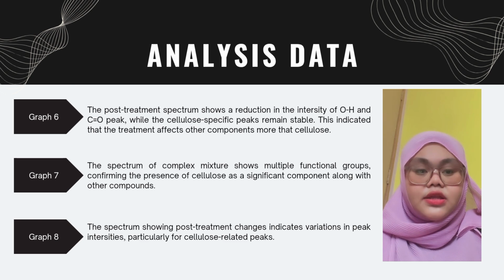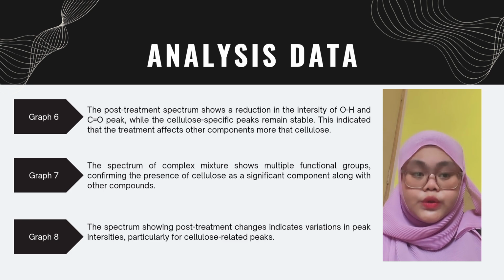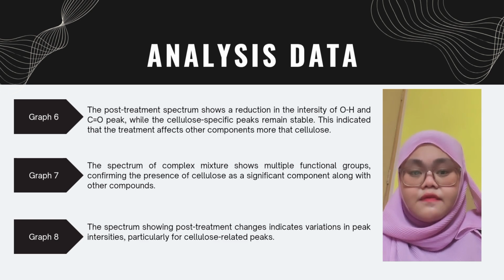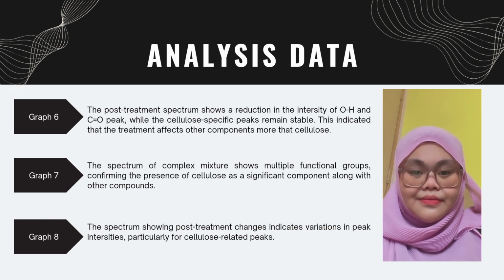Graph 7, the spectrum of the complex mixture shows multiple functional groups, confirming the presence of cellulose as a significant component along with other compounds. Graph 8, the spectrum showing post-treatment changes, indicates variation in peak intensity, particularly for cellulose-related peaks.